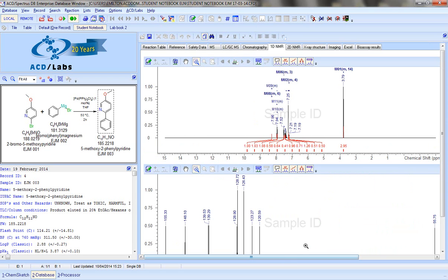We can very easily generate 1D NMR spectra, proton and carbon in this case, and we can generate multiple reports and report outputs from Spectrus Processor for easy archiving and transfer into patents and publications.